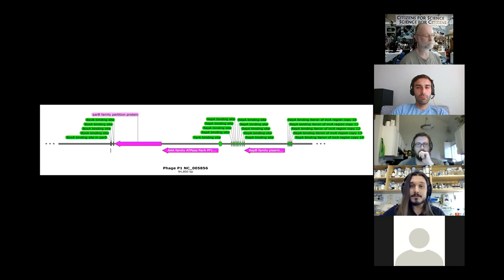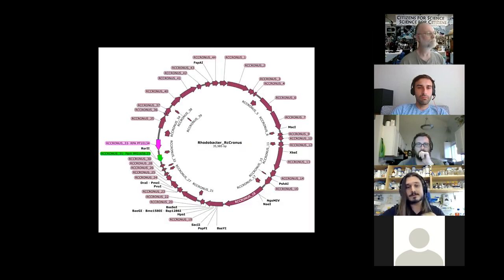So digging even further, we found this. This is one of the only phages ever discovered that had 10134 replication protein next to a PAR A-like protein with very high homology. If these are so close to each other and there's also repeats, there's an extremely strong possibility that this specific plasmid came from a phage, or at least has some prophage origins.